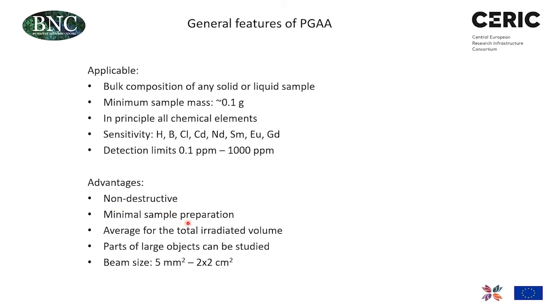We also don't need to do any significant sample preparation. If the sample is self-supporting, then it can be placed into the sample chamber without any preparation at all.